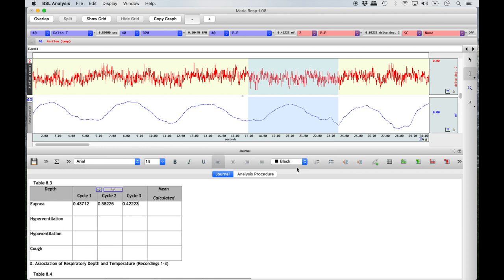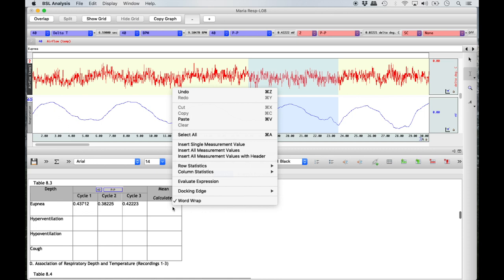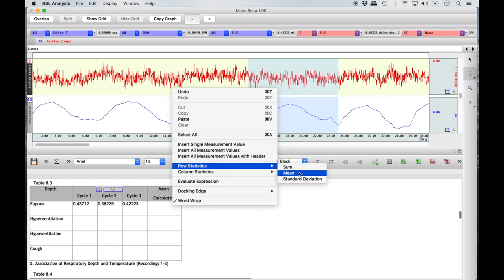Once all three cycles for the eupnea recording have been measured, calculate the mean values by right-clicking in each row of the mean column, selecting 'Row Statistics' from the menu, and then 'Mean' from the submenu. Be careful not to accidentally select 'Column Statistics,' as the submenu is identical.